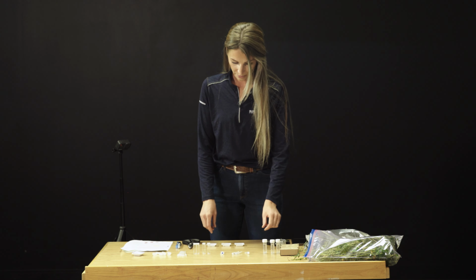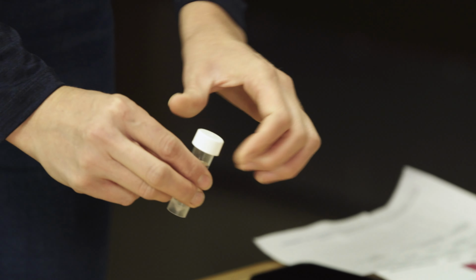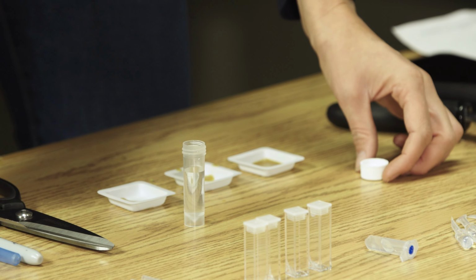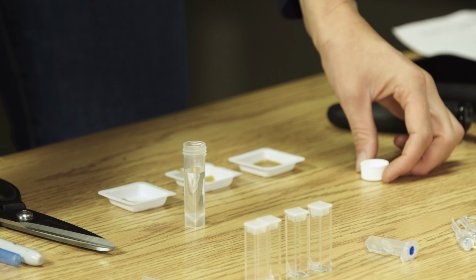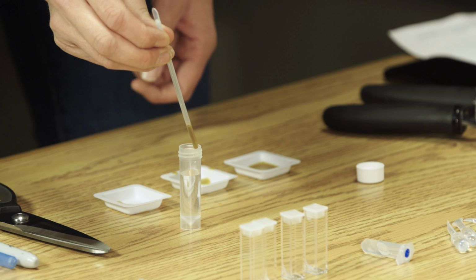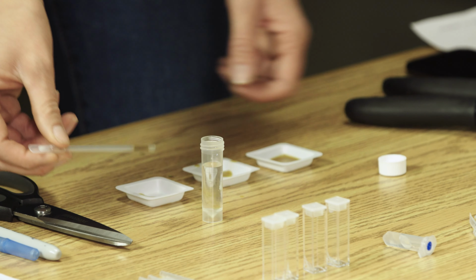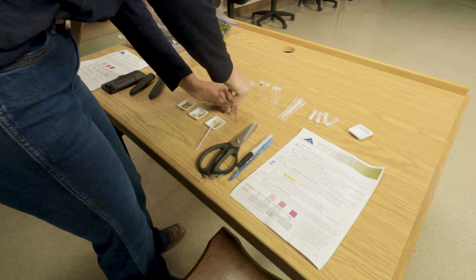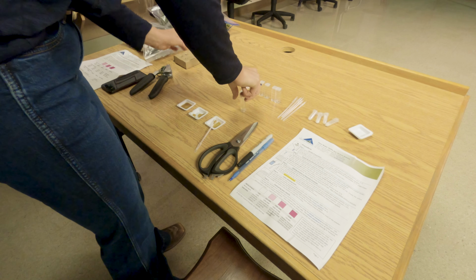Once you have your sap sample, you will open up your water and take 1 drop using a pipette and add it to the tube. For each sample, you will use a different water tube and different pipette.